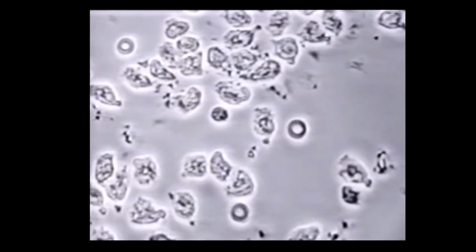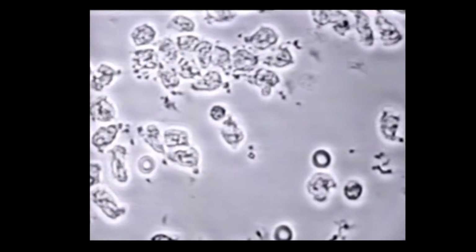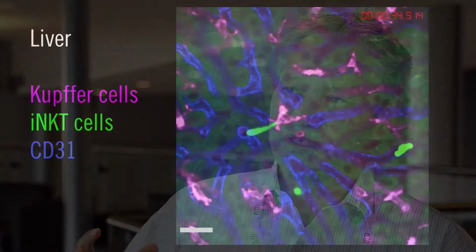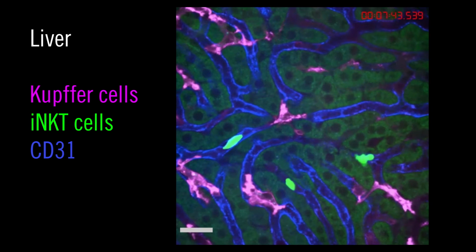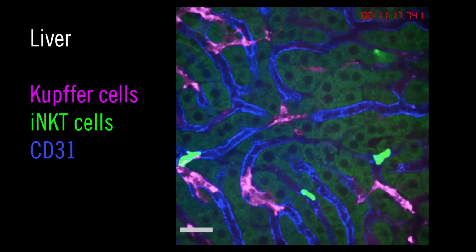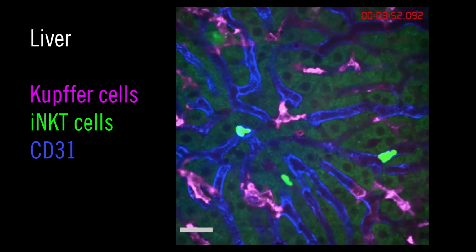And so we started off with some very simple microscopies, just white light microscopies, just being able to look at different cell types. Realized that without taking it up a notch, we never really understood what kind of cells we were looking at. And so then we moved to systems like two-photon microscopy, spinning disk microscopy. These are microscopes that now allow you to inject a tag and light up all the neutrophils red, light up all the platelets green, light up all the macrophage yellow. And we can now look at how these cells interact.